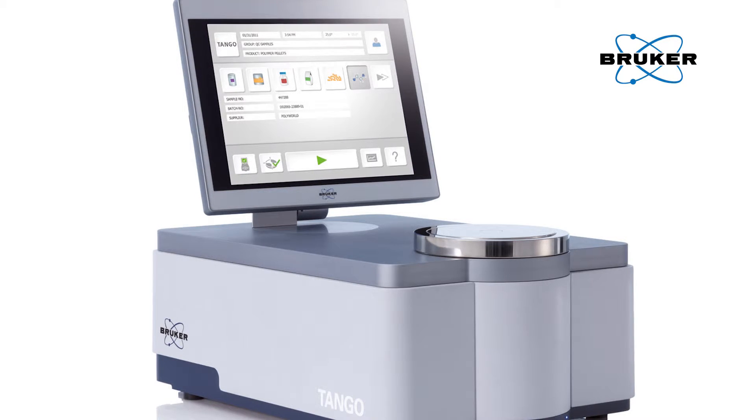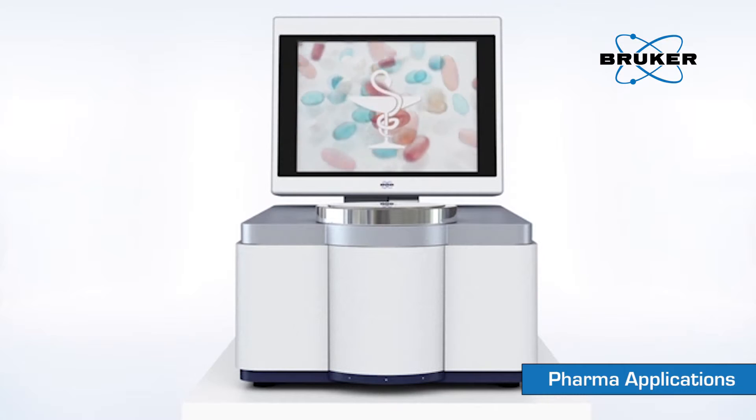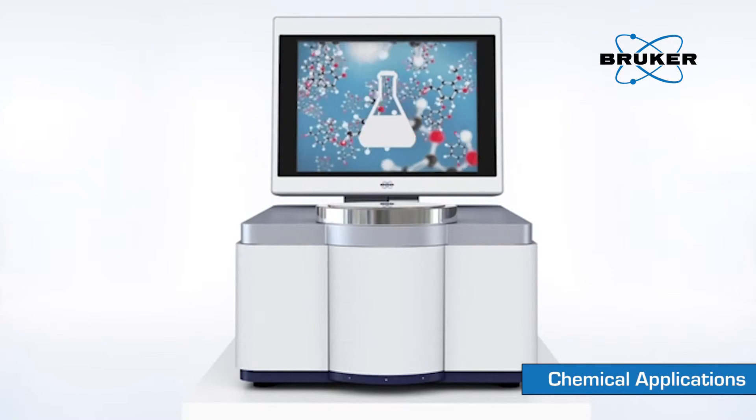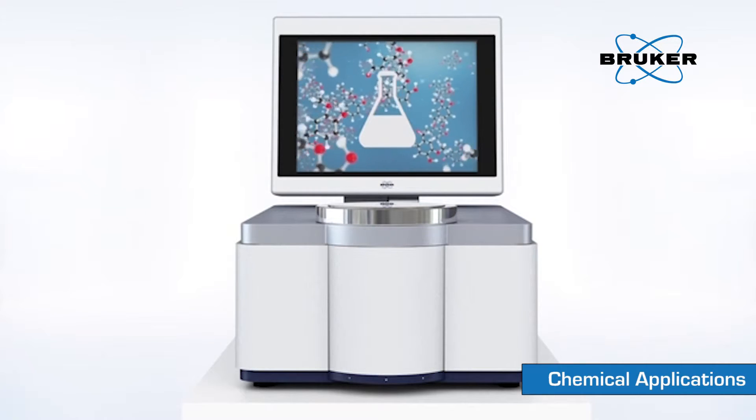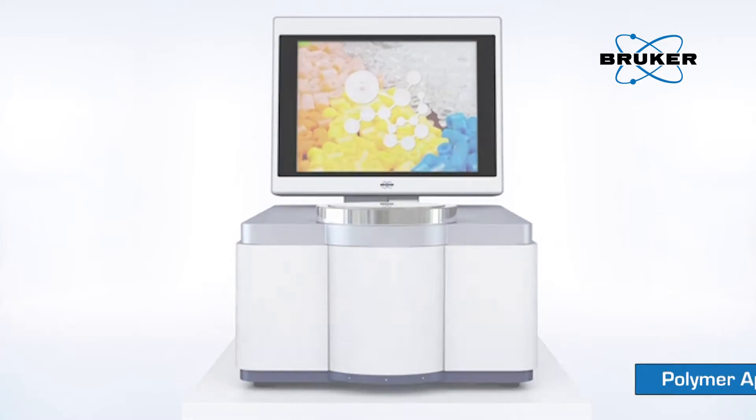The Tango offers an efficient and cost-effective analysis for material identification and quantification in a wide variety of application fields. The comprehensive application support of the Bruker Specialists helps to select the optimal measuring method, as well as appropriate accessories and software solutions.